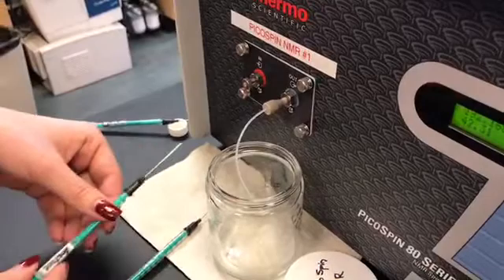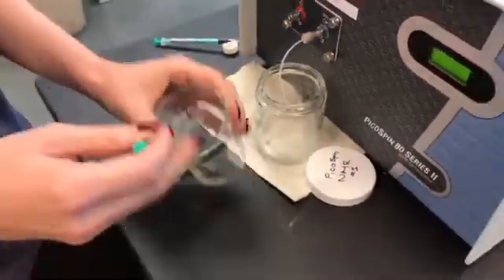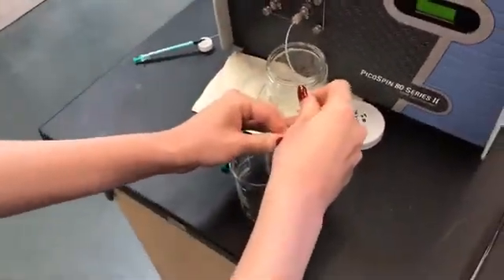The second thing we'll do is flush it with acetone, so we'll get the syringe labeled acetone, and we'll draw up again about 0.4 milliliters of acetone.